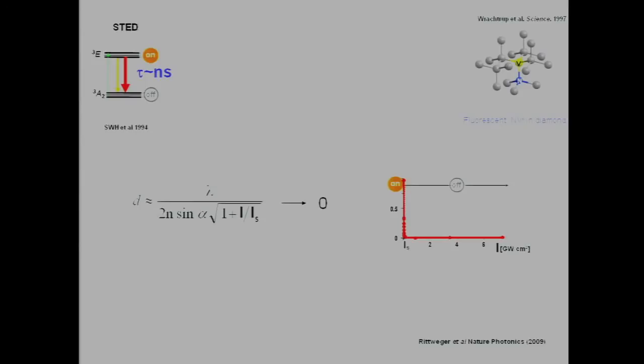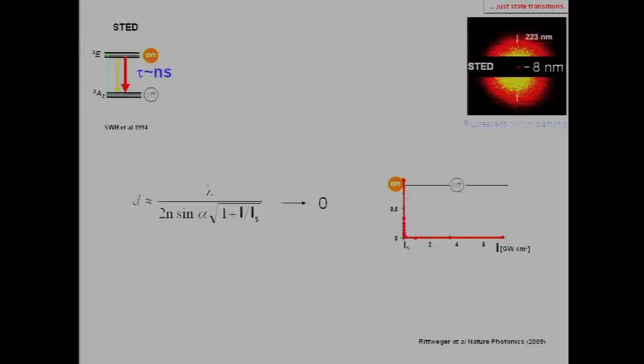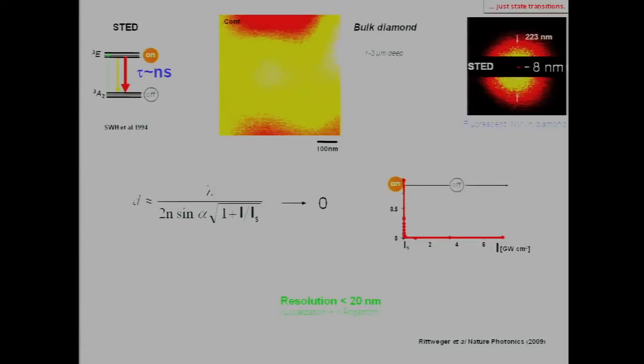So here we demonstrate this very steep on-off switch. And as a result, as you see here, we squeeze down the area in which the molecule or molecular system, in this case, is allowed to emit to very small dimensions, 8 nanometers, coming from about 220 nanometers. And just by using the transitions between the states, the bright state and the dark state, kicking it down from the bright state to the ground state, making sure that when it's off this little area, it's not capable of emitting. And so you can take sharper pictures. For example, here, this is a standard resolution of defects in diamonds. And here, you can separate them. You can see them very, very clearly.